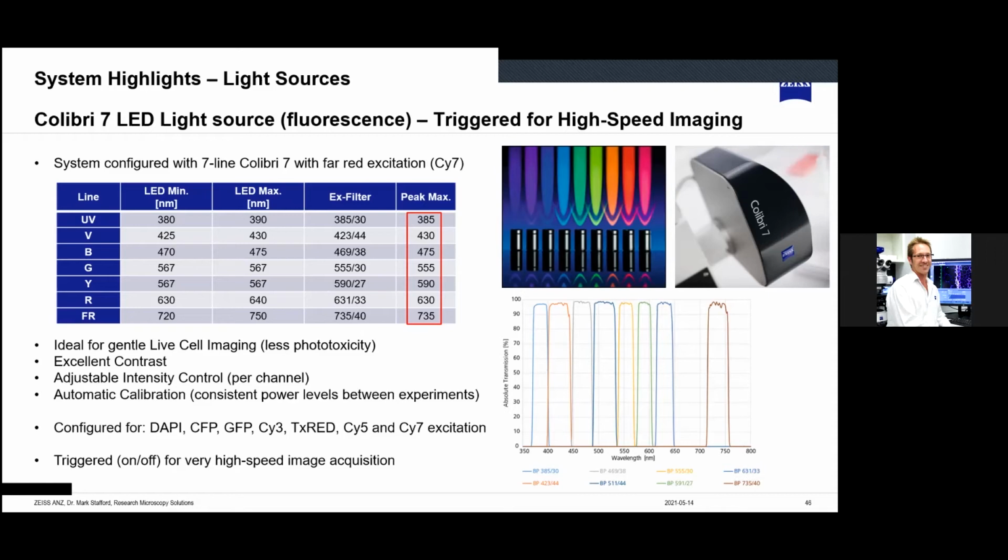LED, as I said, is very gentle for live cell imaging. It gives you excellent contrast. You can adjust the intensities of each of these individual LEDs within your experiment. So you can have one at a high intensity and one at a low intensity if you need to.